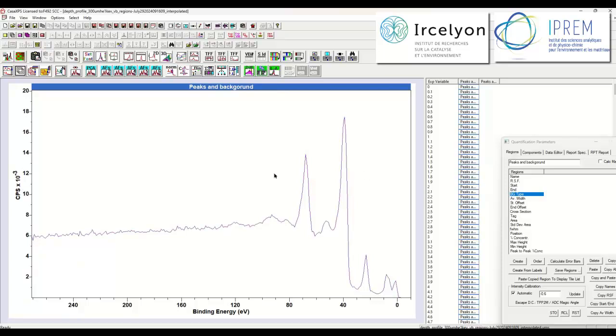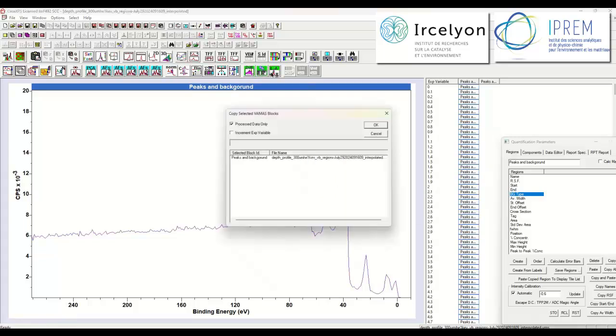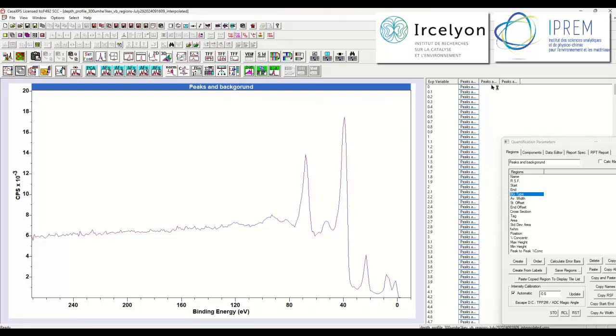What we've got is something here which might be a combination of an oxide, it must be because this is the oxygen 2s, and this is the vanadium, and there may still be some metal in there. I can't fully remove it with this data set, but this represents a new possible basis spectrum that I can use in a least squares calculation. So let us now save that one. So we've got 2 spectra, and this is highlighting exactly what I was looking for.